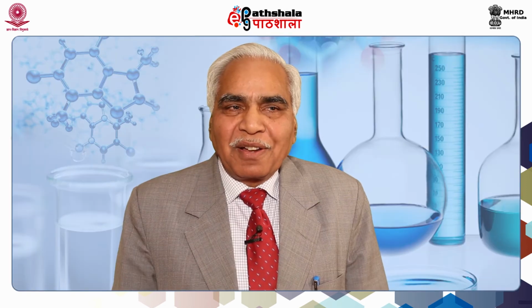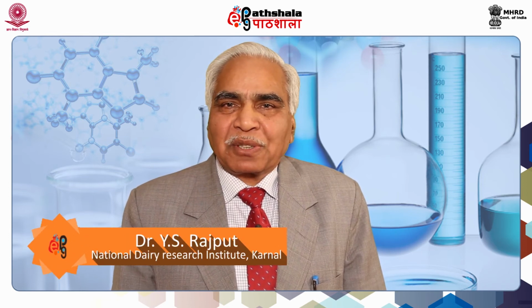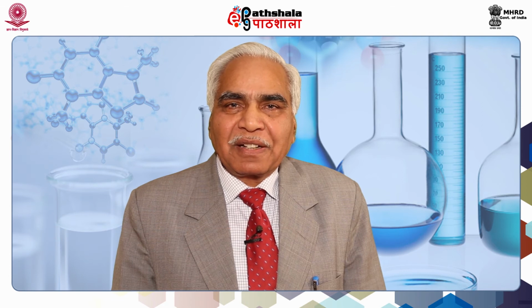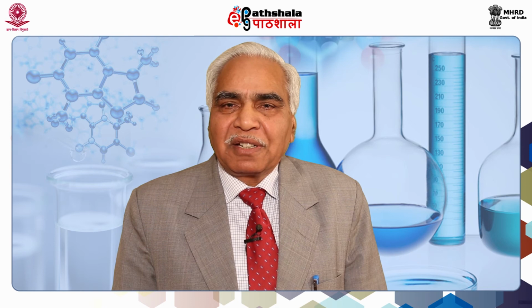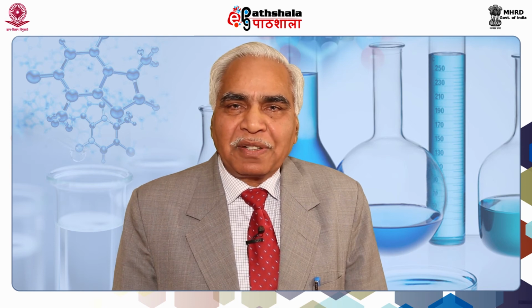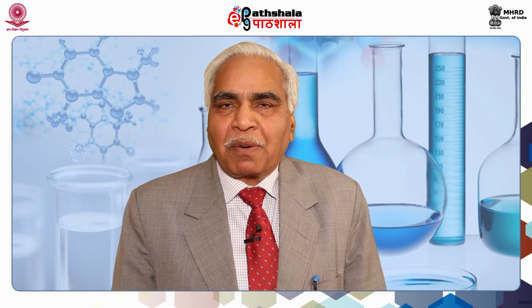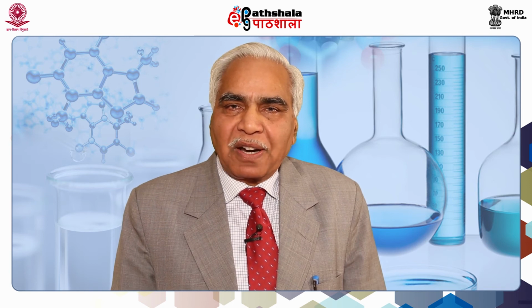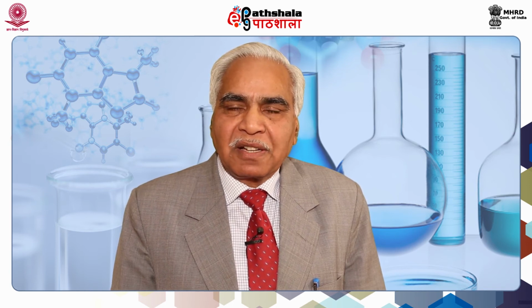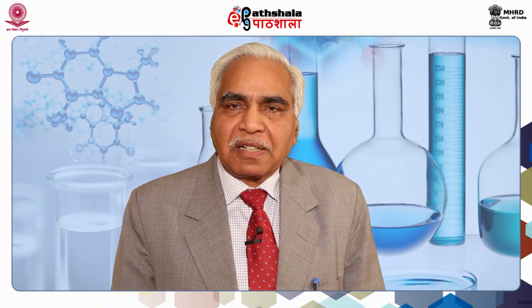Dear students, by now I have covered theoretical aspects of the isoelectric focusing technique, and you must be very clear that proteins differing in their isoelectric point can easily be separated by the isoelectric focusing technique. If you see the resolving power of this particular technique, proteins that differ in phosphorylation or in glycosylation can be separated by isoelectric focusing.